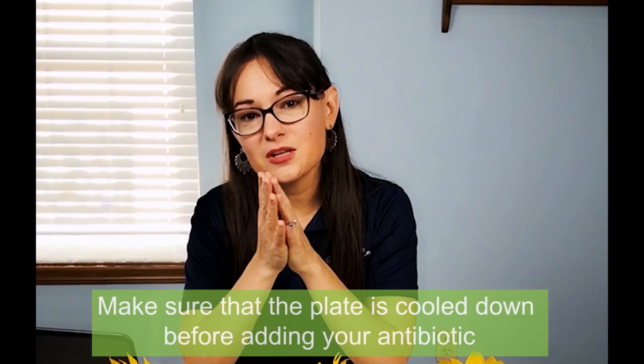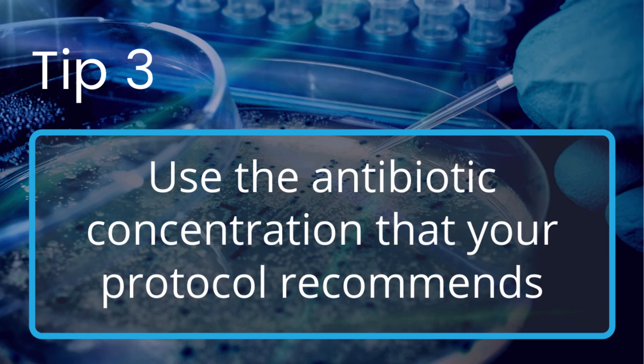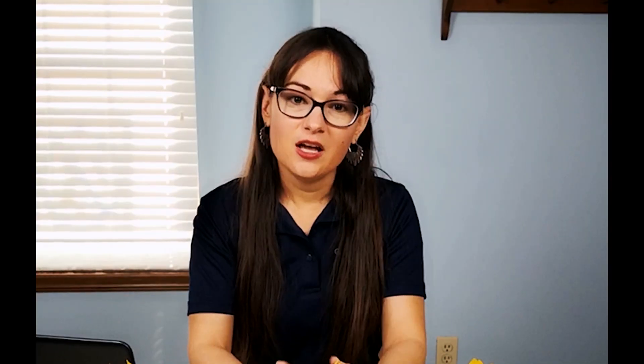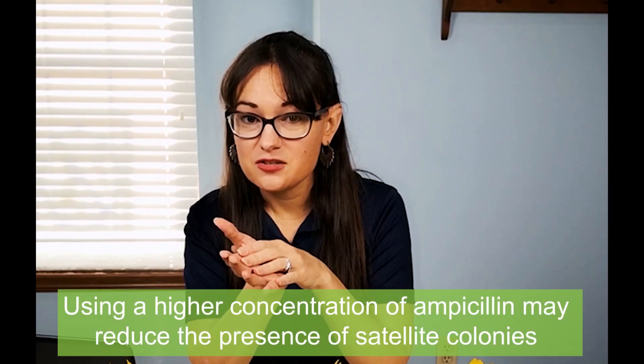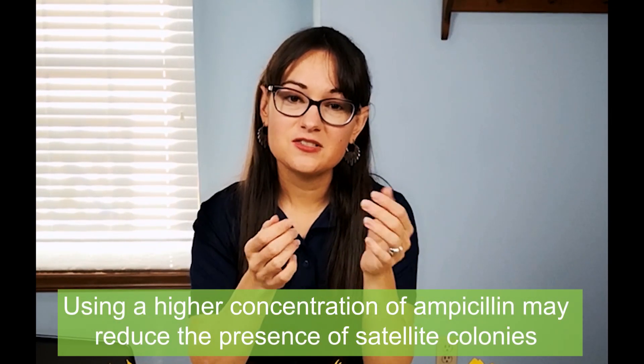Make sure that the plate is cooled down enough before you add that antibiotic. The next tip is just to use the antibiotic concentration recommended on your protocol to prevent those unwanted colonies. Using a higher concentration of ampicillin than recommended may also reduce the presence of satellite colonies, so if you are getting satellite colonies you might just want to bump up that concentration.